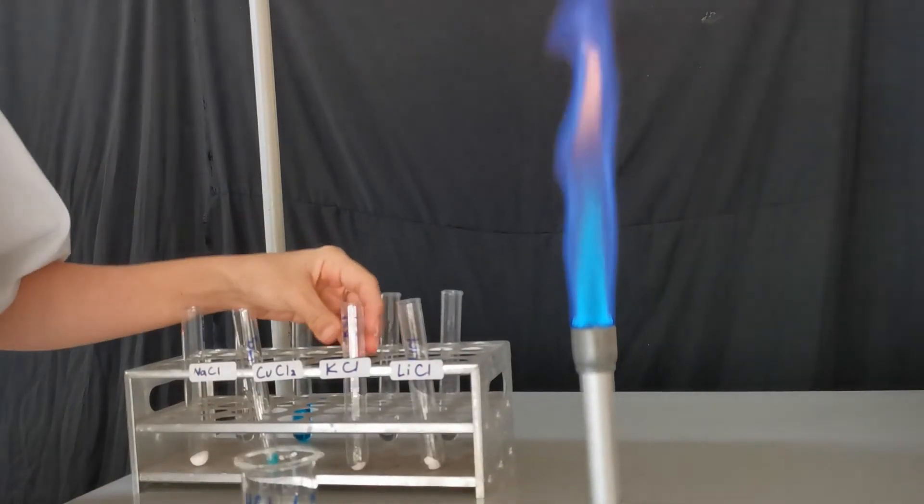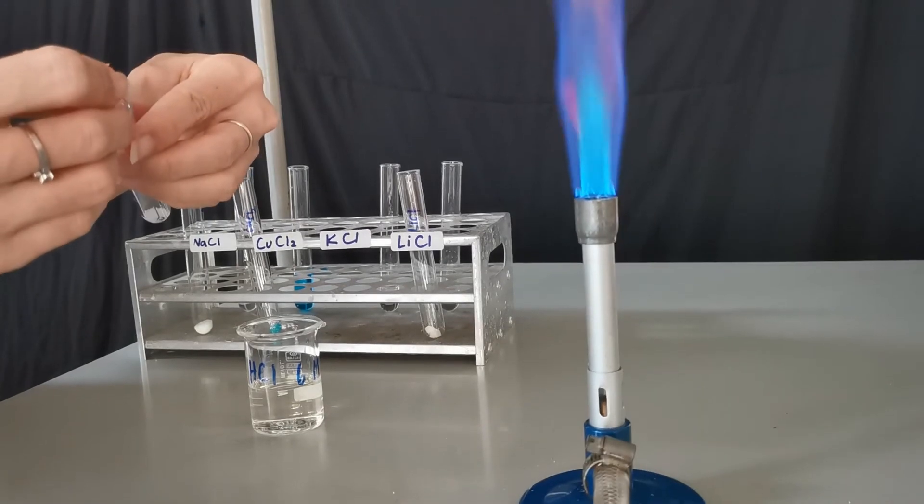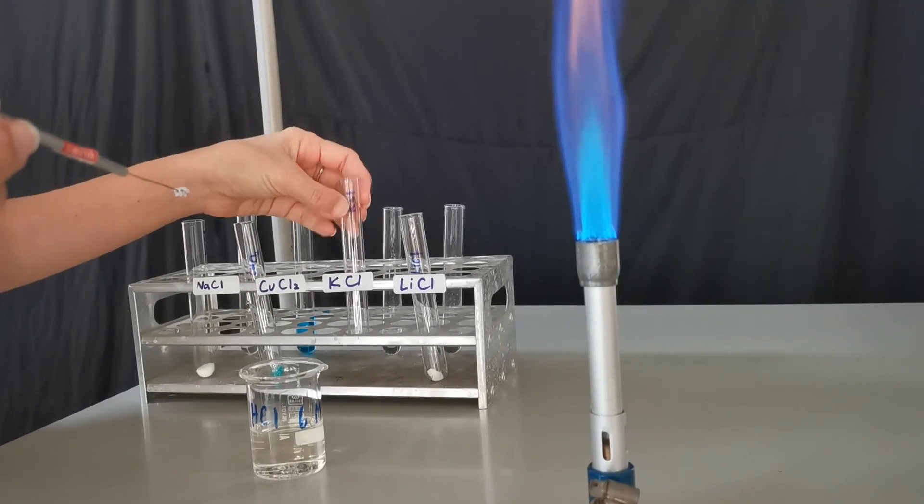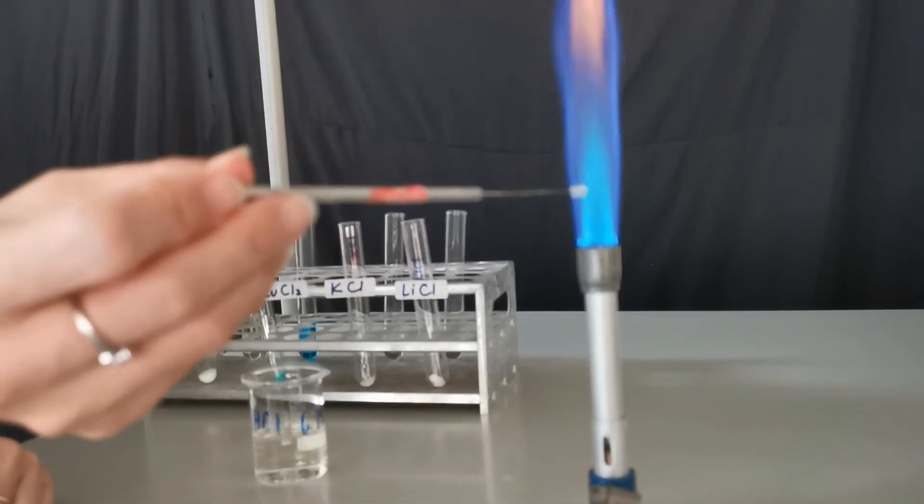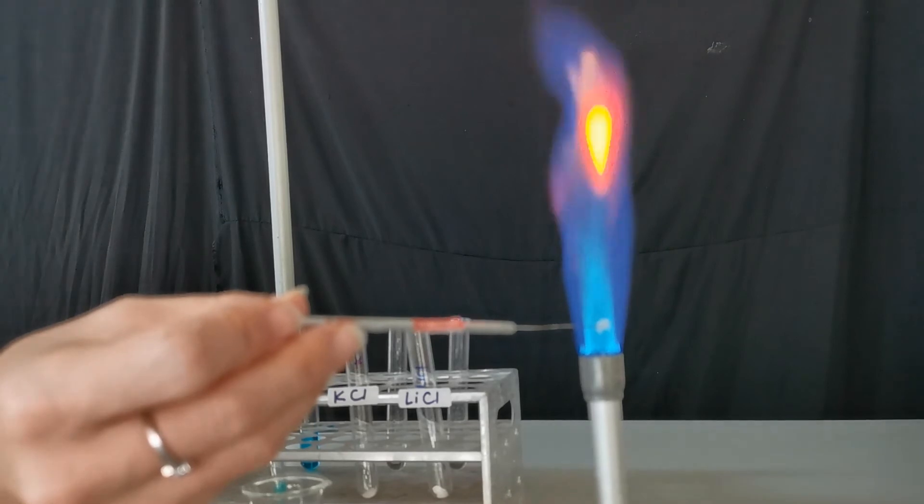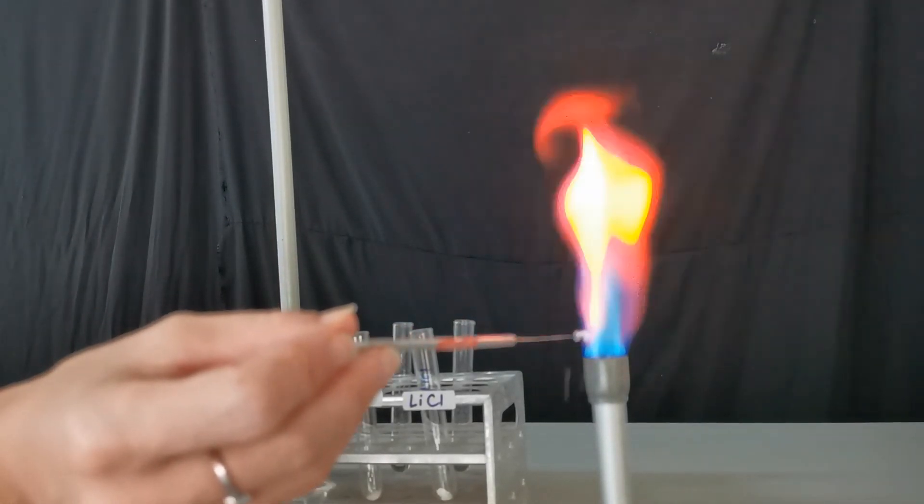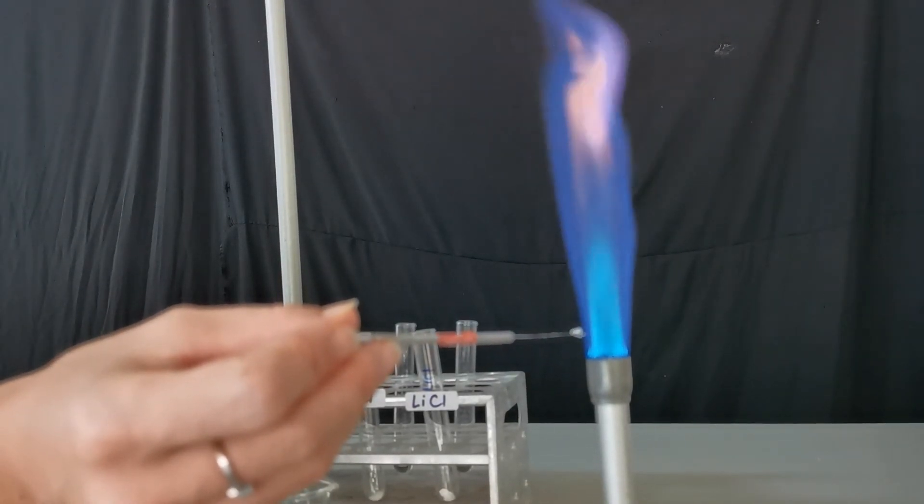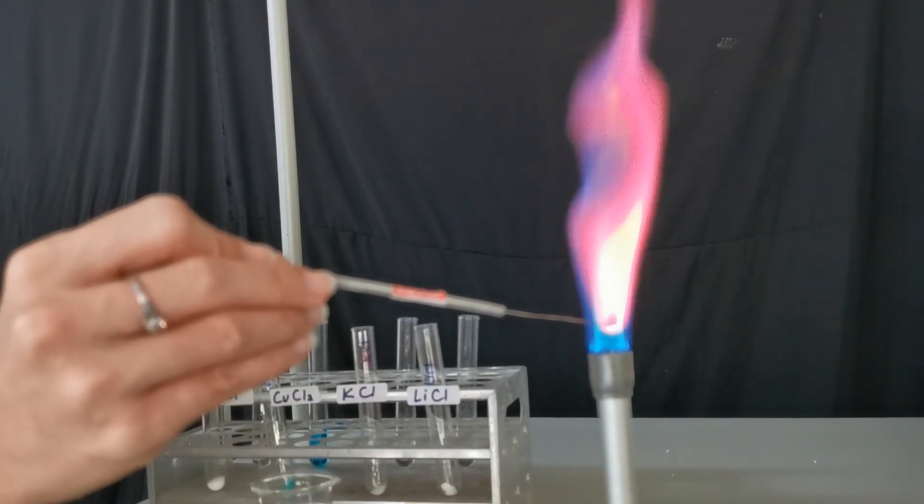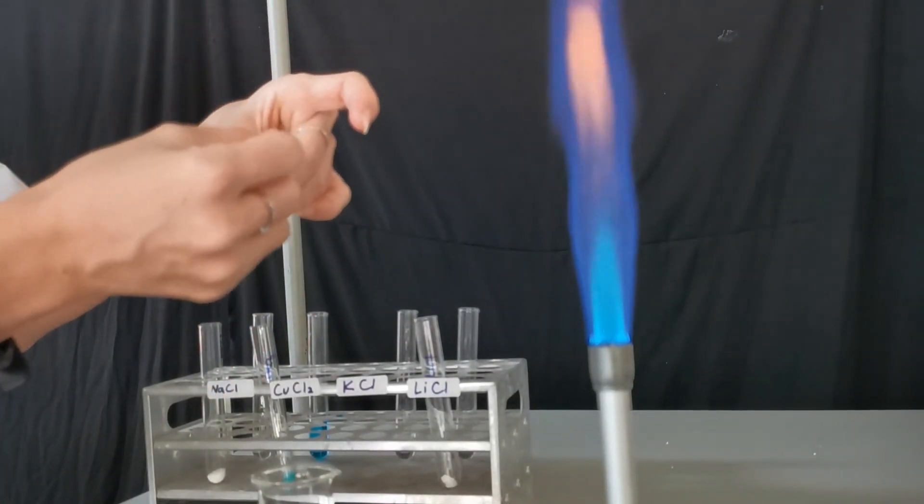The last ion that we're going to do a flame test on is potassium. Sometimes the color of potassium flame is a bit hard to see. Let's see what it looks like. The flame color has a tinge of purple, if you can see on this side here. It's got a tinge of purple lilac color, and that's exactly the color that we want to see for potassium.